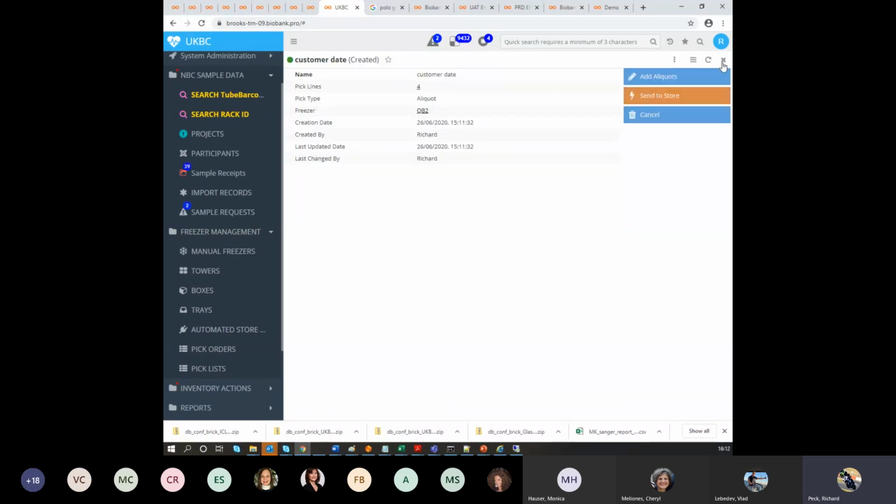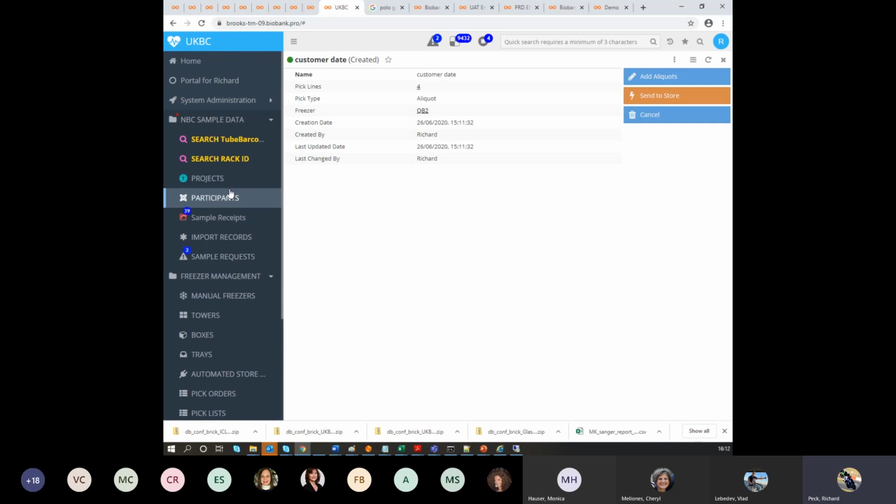Once we're happy that all of our samples are on our pick order, we can click Send to Store, and this will send the request to the store. The store will pick the samples, and then it will output them for the user to pick up from the I/O. And I think that's the main areas that we integrated with.